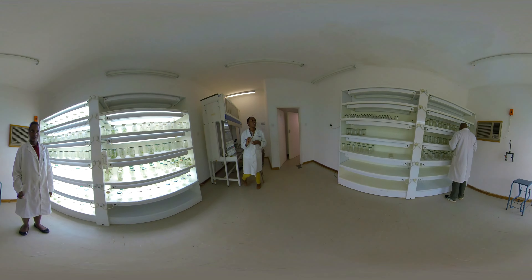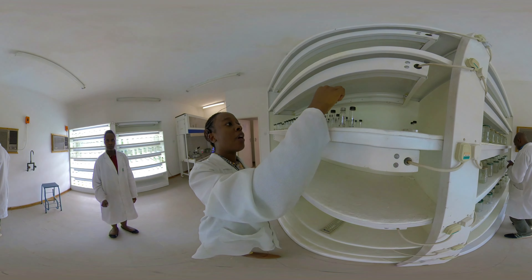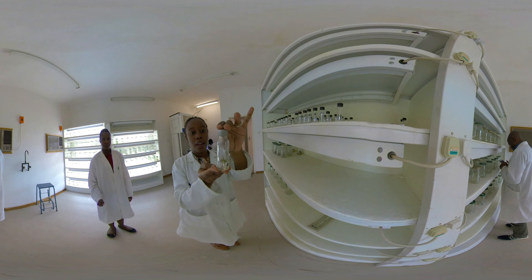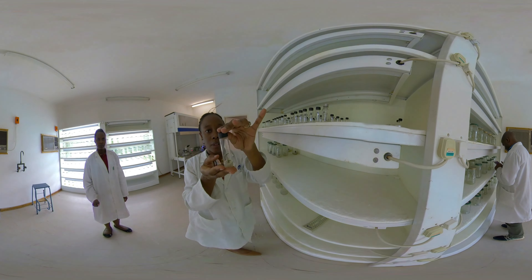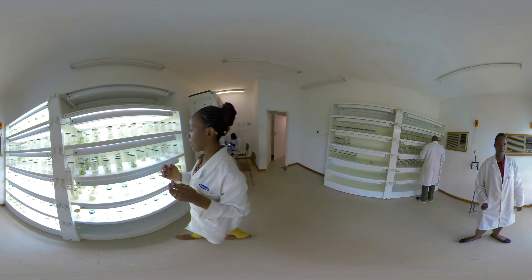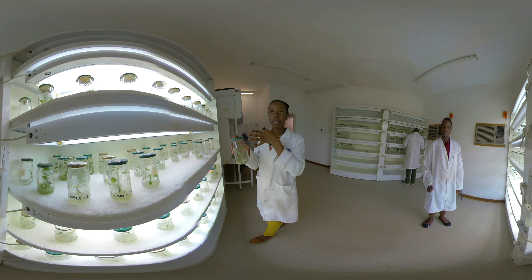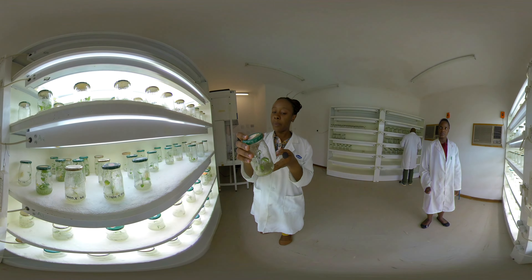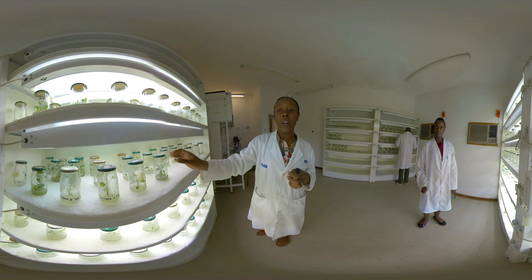Once we have cultured our meristem tip, we place it on our culture shelves and allow it to grow. After several weeks the meristem tip develops into a callus, which you see right here, and then from that callus a shoot develops. Once the shoot has developed we then place it into these bigger jars and allow them to grow for rapid multiplication. The jars that you see from your left to your right are growing plantlets cultured from a single meristem tip, and they will give us plenty more virus-free plantlets.